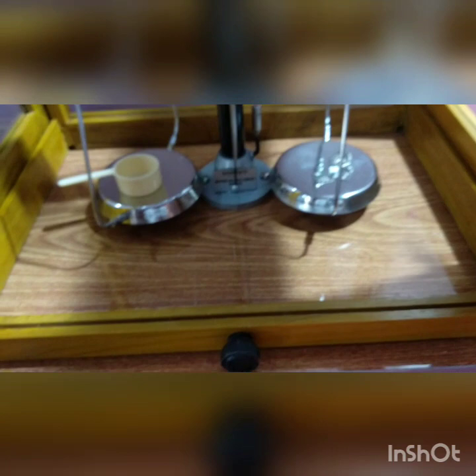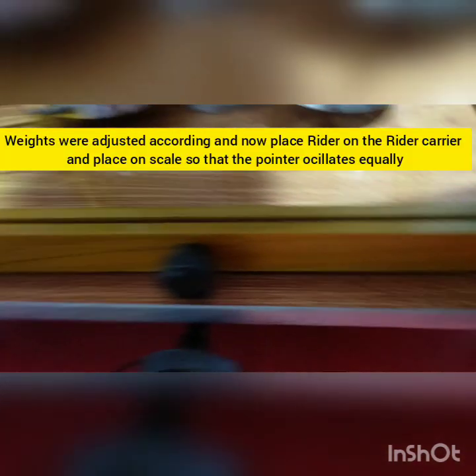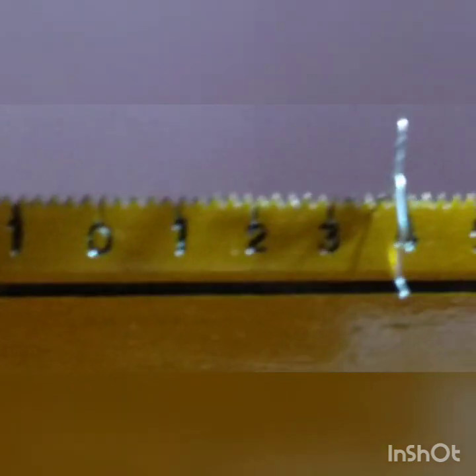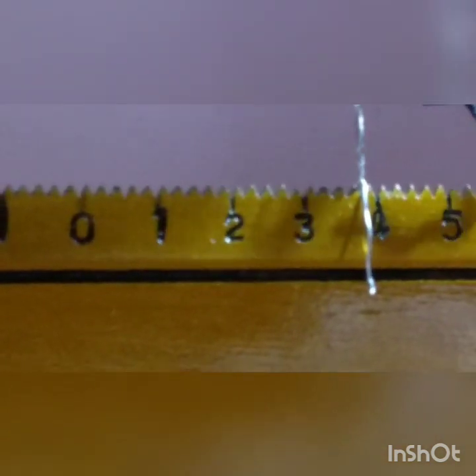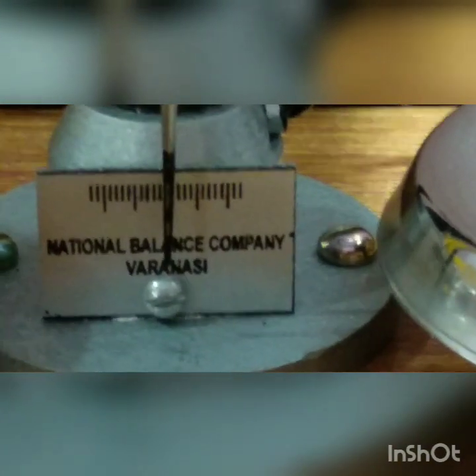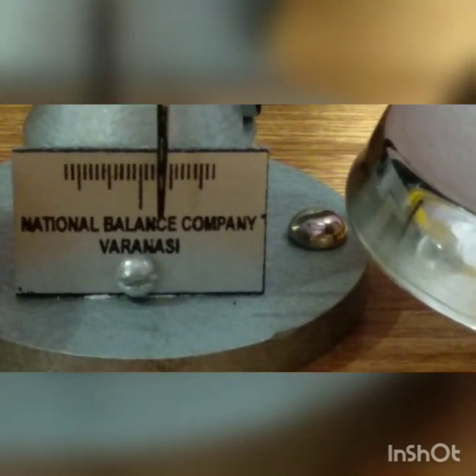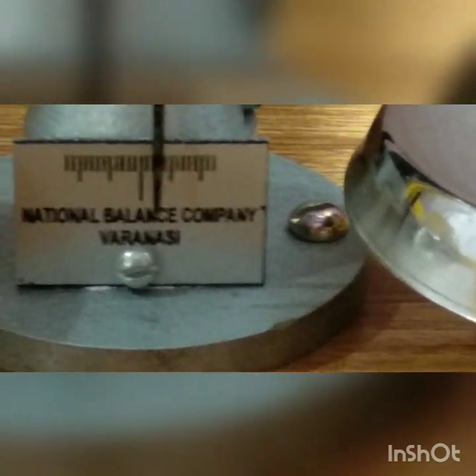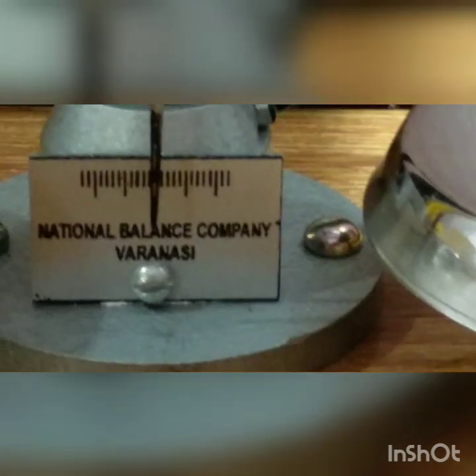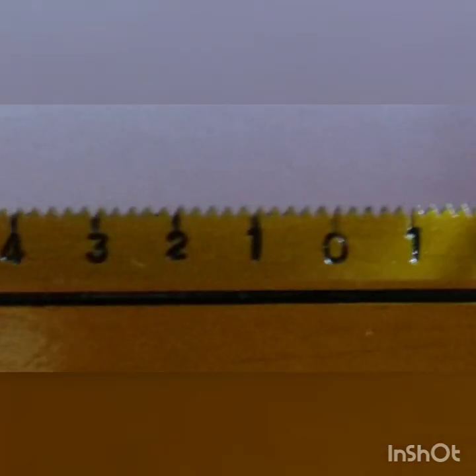Take the 10mg weight and put it here. Place it on the pan, near about 4, and then check. Now we will place the rider at 4.2.